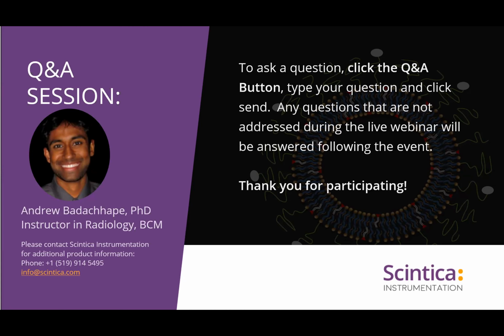However, one thing that I would like to talk about with the 1 Tesla scanners that we do use is, like I mentioned, the relaxivity profile for our agents is optimized at those lower field strengths. And also we are able to have a pretty high throughput just based on our system and being able to have equipment in the room. I can't stress enough how useful that is for the imaging that we perform.